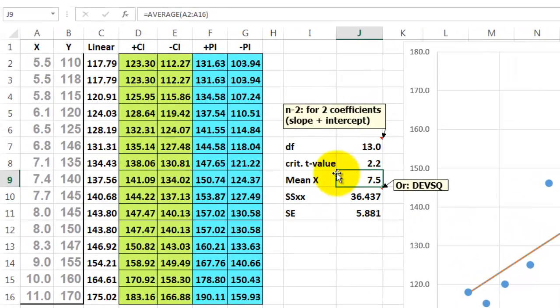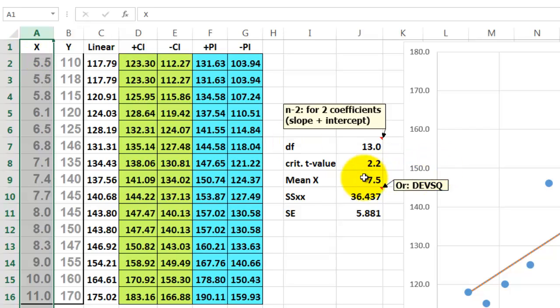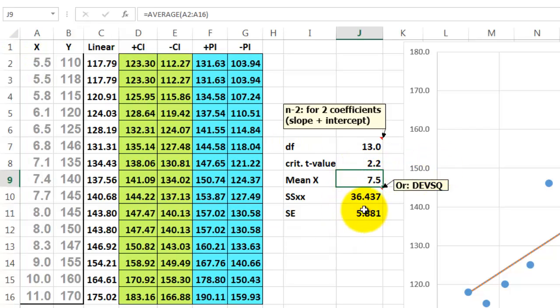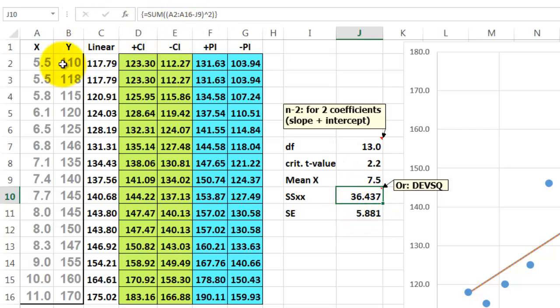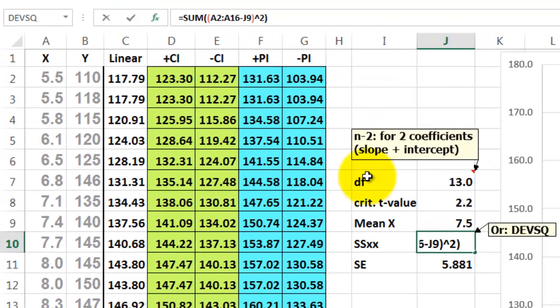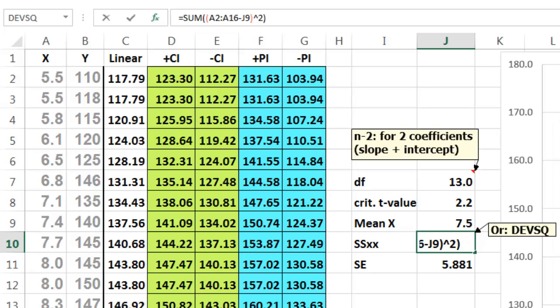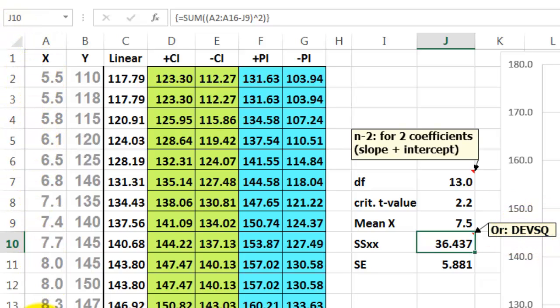Then we need the mean of the x-values. Then we need the sum of the squared values between every x-value minus the average x-value, which is j9. So the formula would look like this: A2 through A16 minus j9 to the power of 2. Don't just click on OK, but do CTRL-SHIFT-ENTER. This is an array function. If you don't like array functions, you could have also used the function DEVSQ and it will automatically calculate the differences between each value and the mean value.